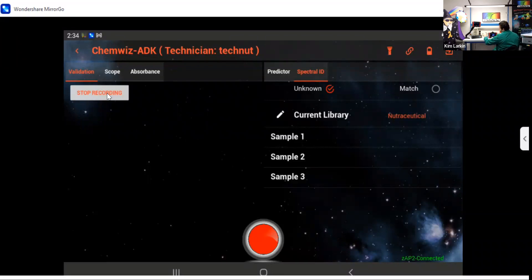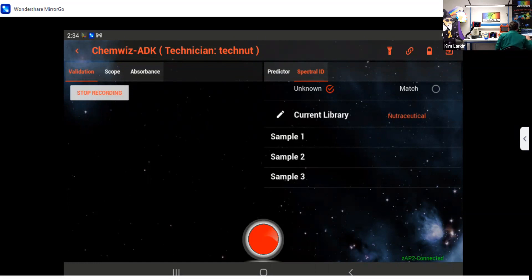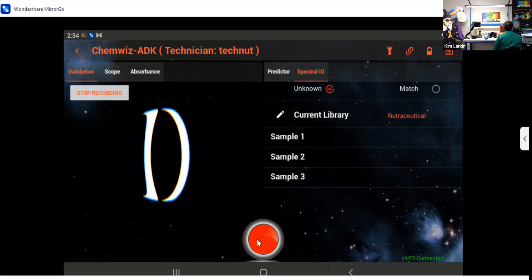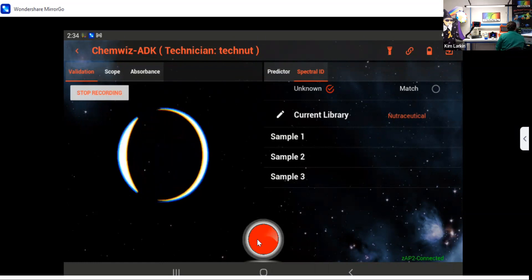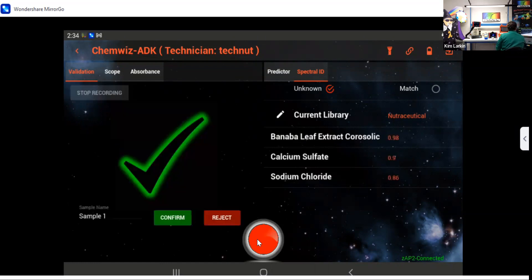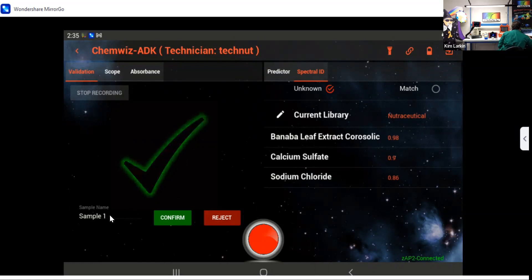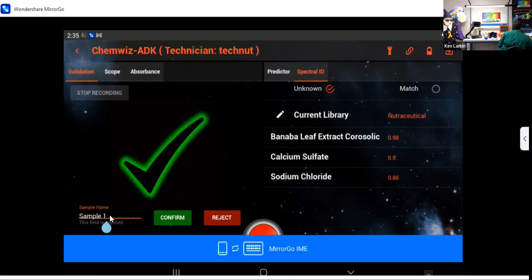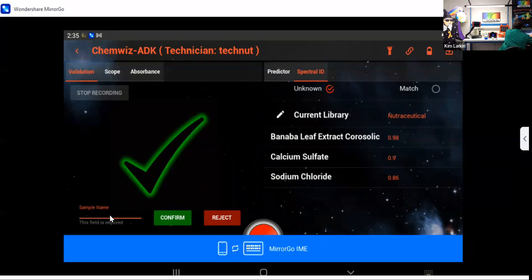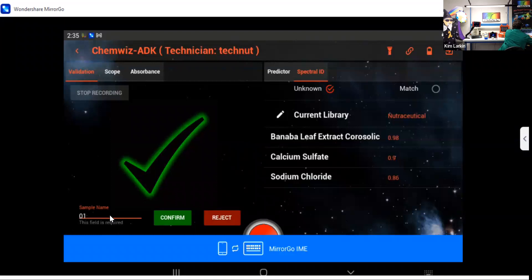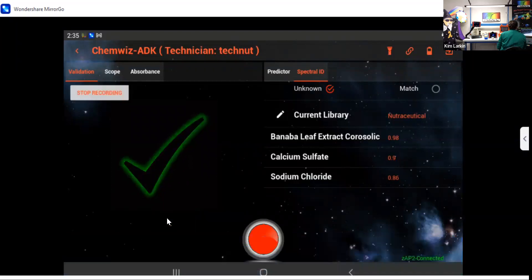So now I'm going to put my first sample on the fixture, and it is a banaba leaf extract. I'm going to go ahead and say tell me what it is. All right, we get a green check and a match to banaba leaf extract. So I'm going to confirm it, but I'm going to give it a lot name. I'm just going to say it's 01, for example, and confirm that it's a good measurement.